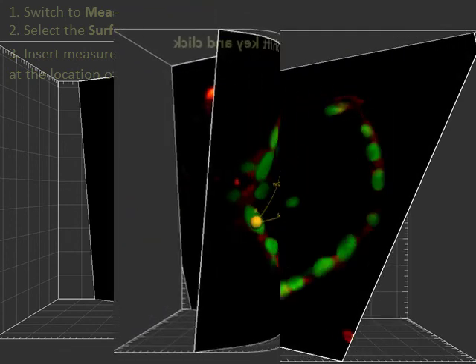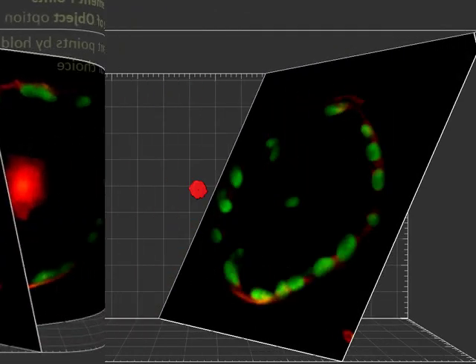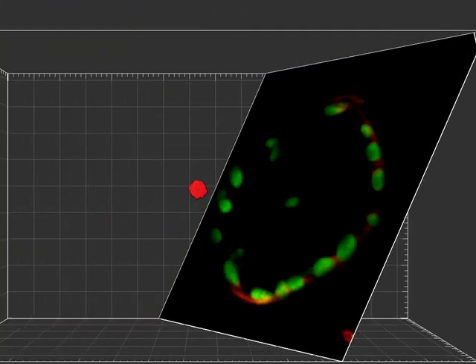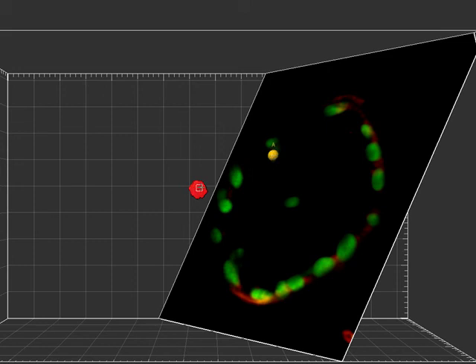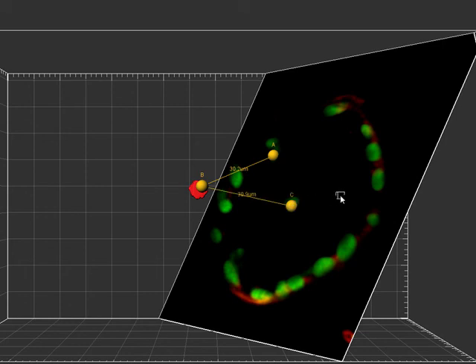In addition, measurement points can be inserted between the oblique and/or ortho slicer and any created objects. By doing so, you can measure the distance between non-segmented structures of interest and any Imaris created objects.